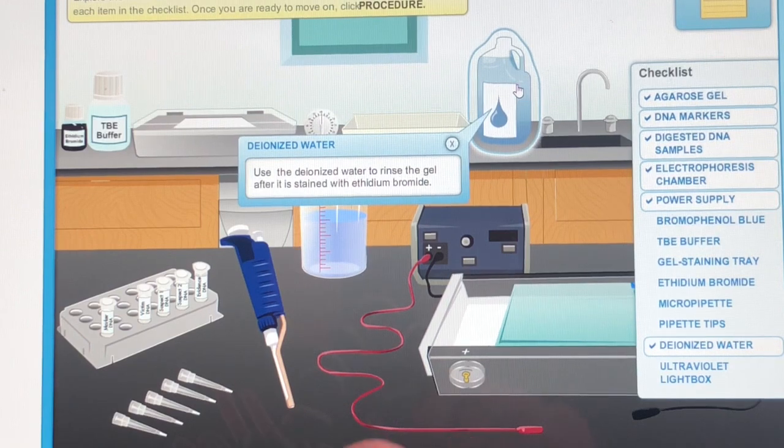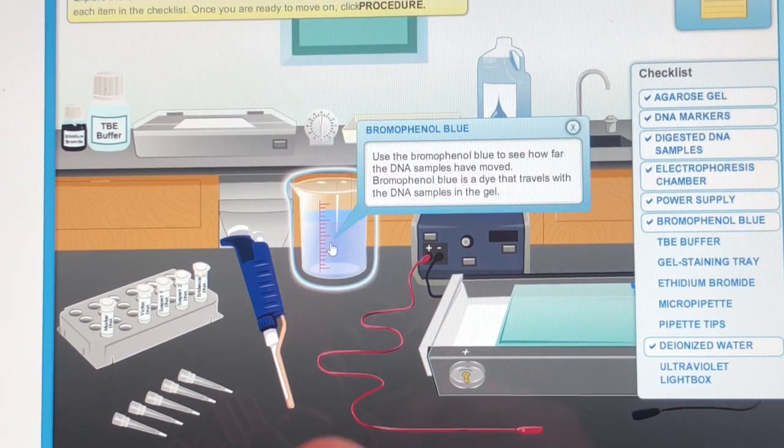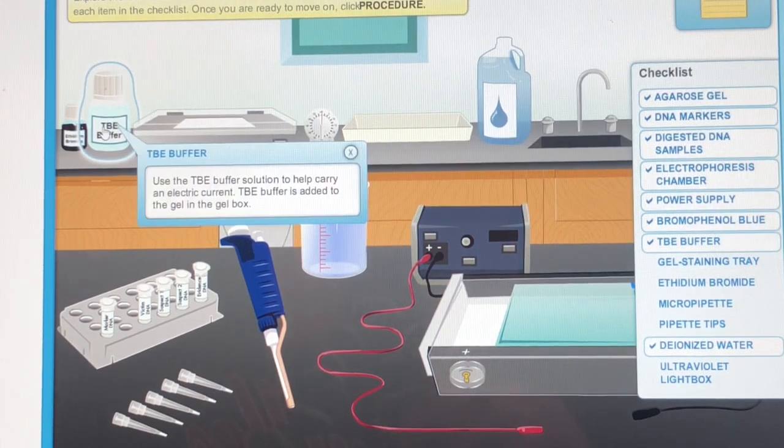Use the deionized water to rinse the gel after it is stained with ethidium bromide. Bromophenol Blue: use the Bromophenol Blue to see how far the DNA samples have moved. Bromophenol Blue is a dye that travels with the DNA samples in the gel. Use the TBE Buffer solution to help carry an electric current.